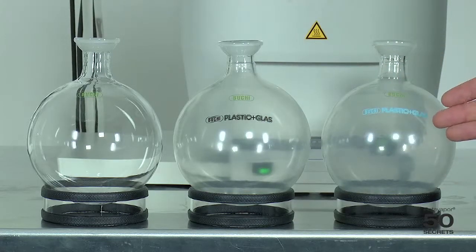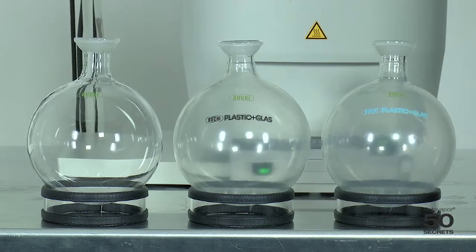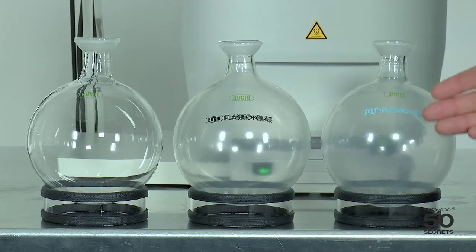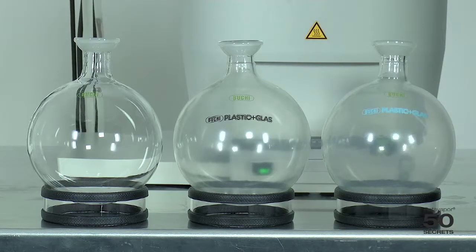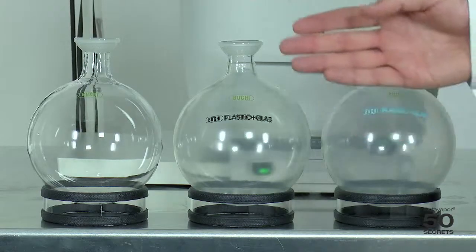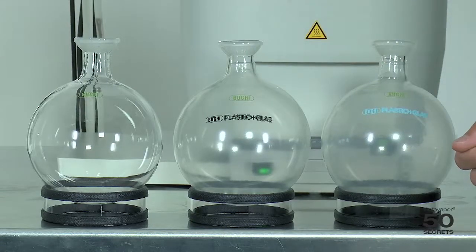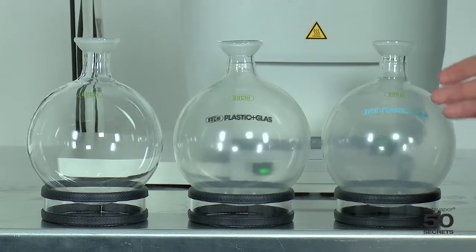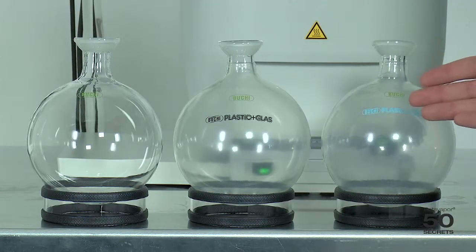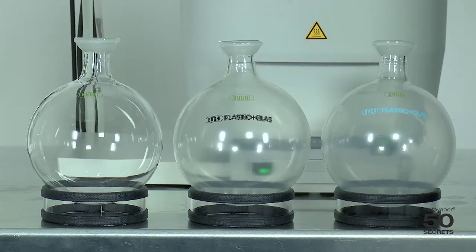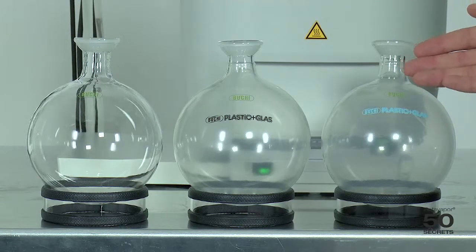And the one on the very right is as well a plastic and glass coating, but this is called PNGLT. LT stands for low temperature. The operating range on the standard coating is from minus 30 to plus 60 degrees, and the low temperature is from minus 70 to plus 40 degrees. This is used especially for cold traps.